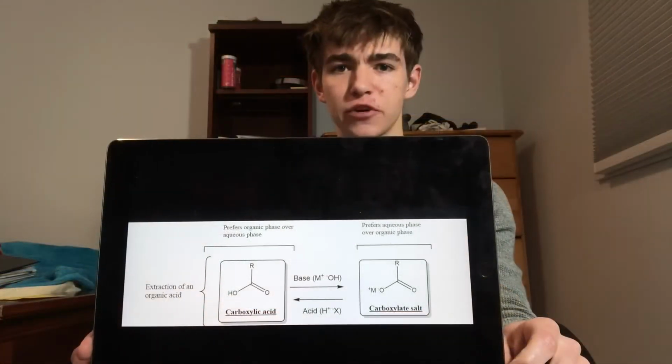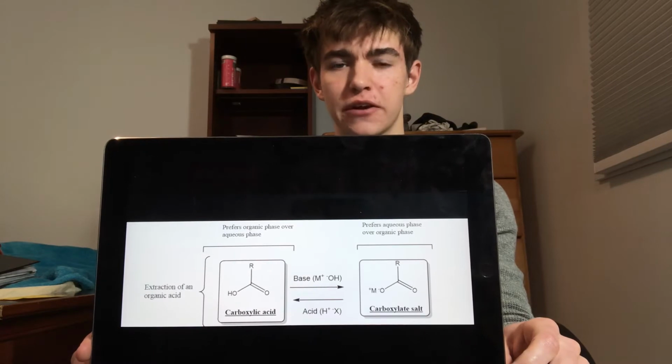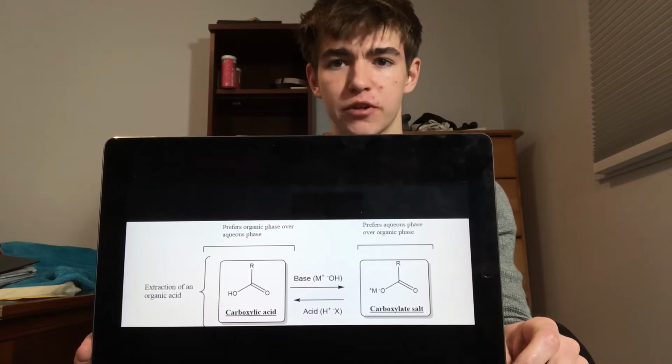Each compound in a solution will prefer residing in one of 2 immiscible phases: the aqueous solution, which will contain your organic acid or base, and the organic liquid, which will contain the organic neutral compound. You can determine the identity of the liquids from looking at their densities. The denser liquid will be at the bottom of the separation flask. You can temporarily increase an organic compound's polarity by making it ionic, which will make it prefer the aqueous phase more than the organic phase.